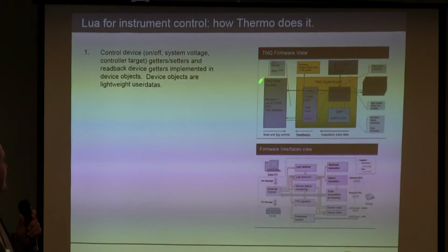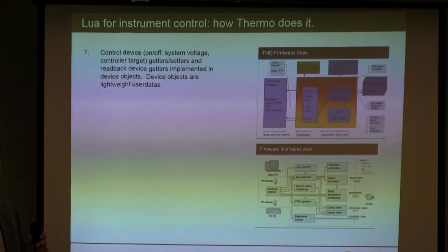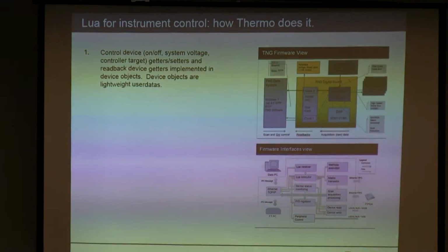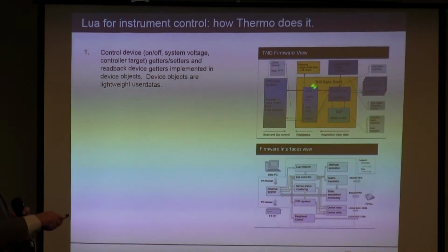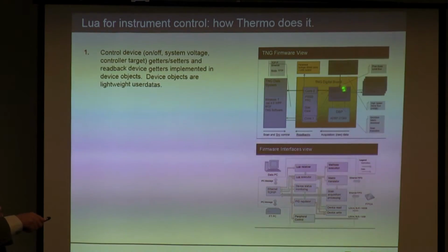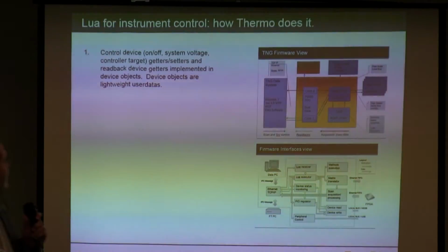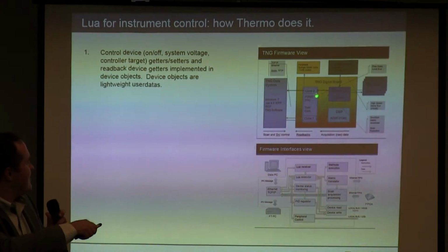And then on the desktop we have a data system, just a Windows box with a user interface and data store. In between, we have a dual-core PowerPC system, and then an FPGA used just as a mailbox, back and forth.